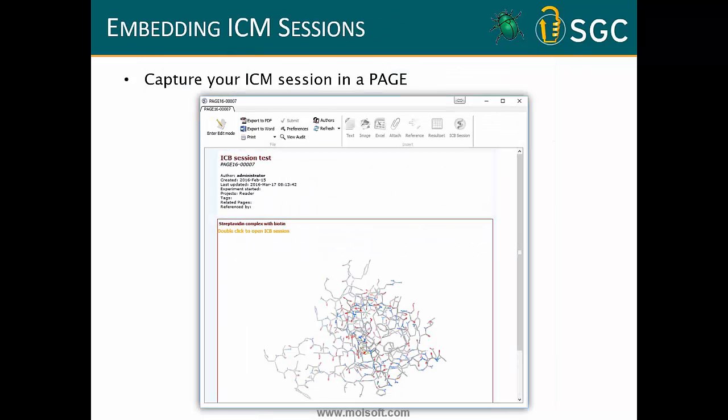So at this point I'm going to pause and ask Andy if there are any burning questions at this point. Yes, we've had a few questions. I'll start with, I'm paraphrasing some of these because they're written down, one question was how interactive are, for example, the plots that you showed? I guess it's asking, are they linked to a table or something like that? And also how interactive are the 3D sessions?